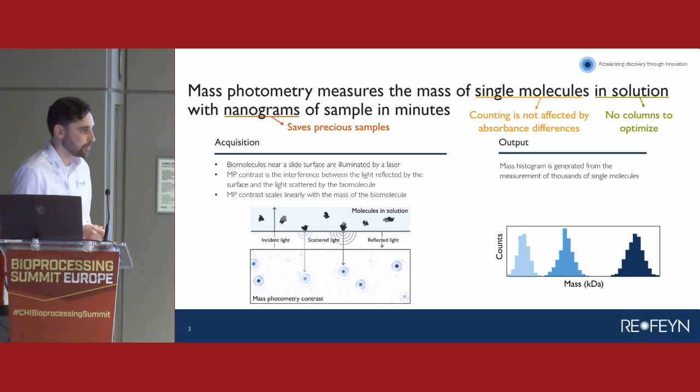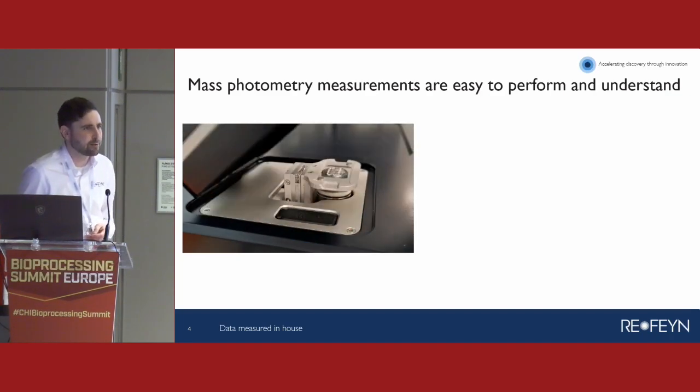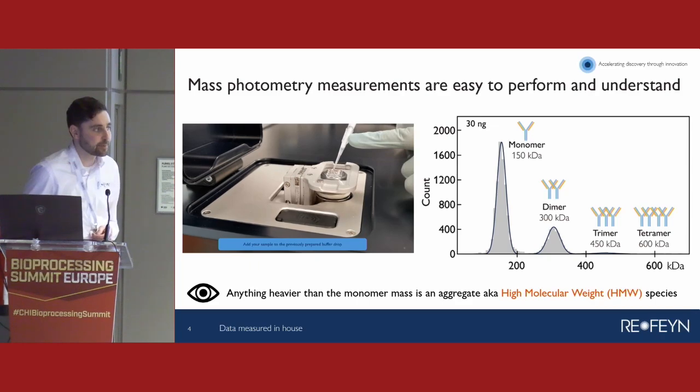Yeah. And from the graph, can you actually deduce the molecule weight distribution? Is it really quantitative? Yes, yeah. Okay. So our mass repeatability is 2%, and our mass accuracy is 5%.